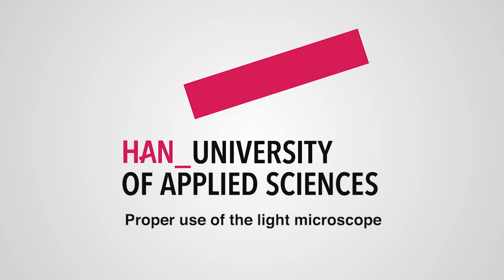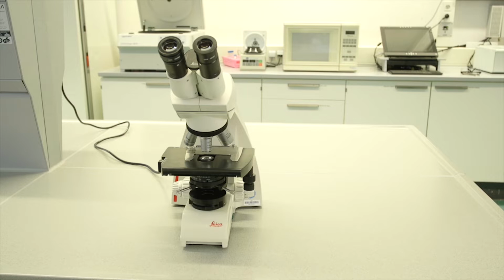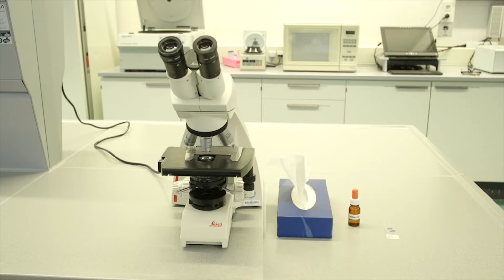Proper use of the light microscope. For this experiment, you will need a microscope, a slide, immersion oil, soft white tissue and lens paper.